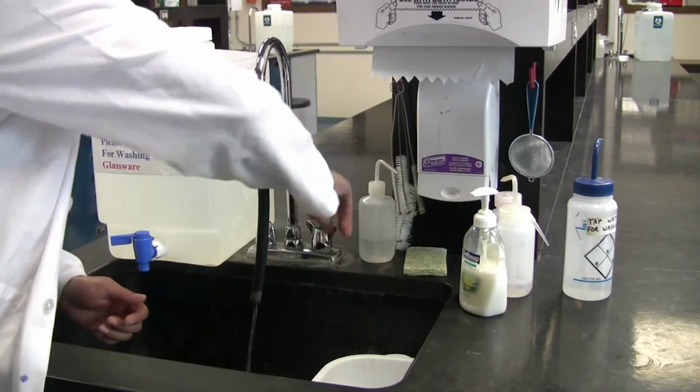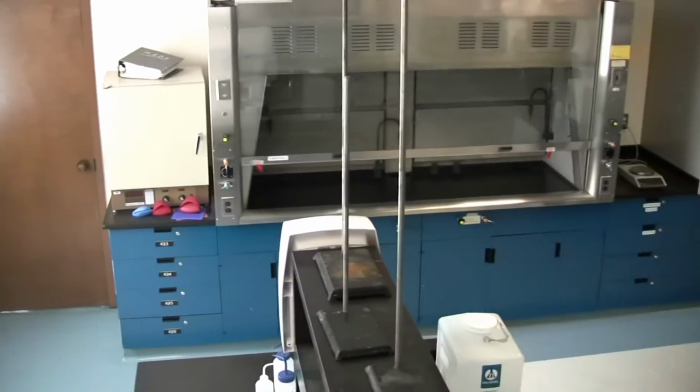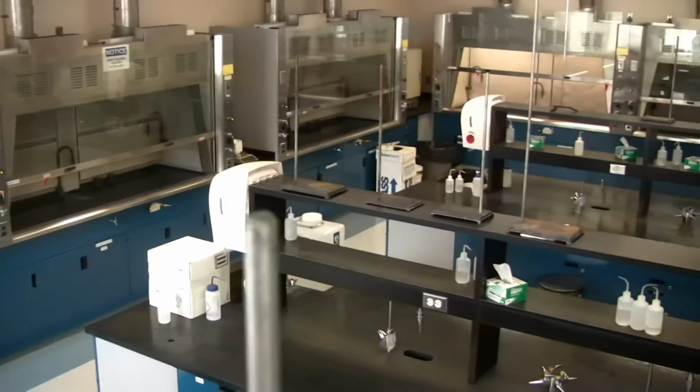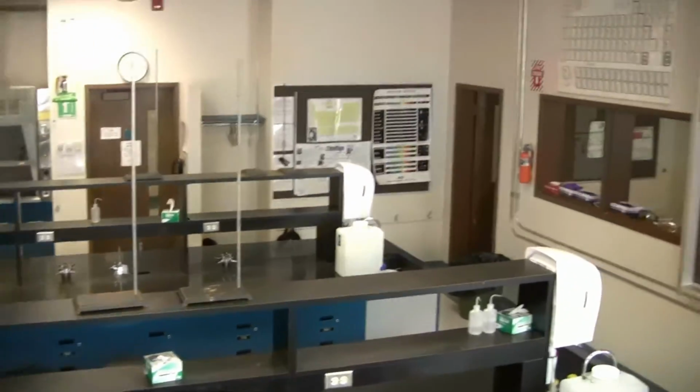Make sure to thoroughly wash your hands before leaving the lab. Remember that you are responsible for your safety as well as the safety of others. If you are unsure about the proper use of certain lab equipment or safety equipment, ask your lab instructor.